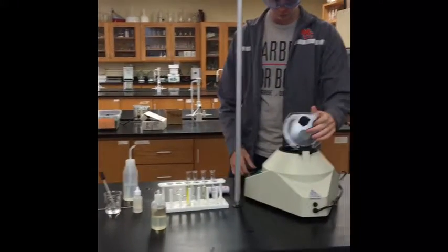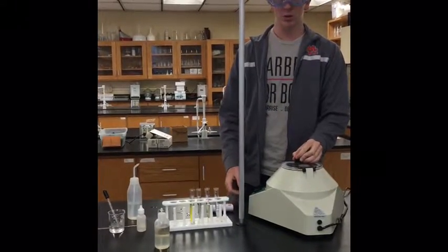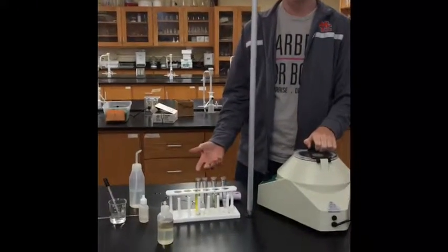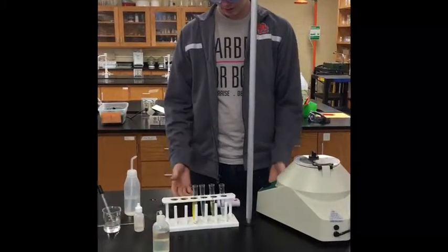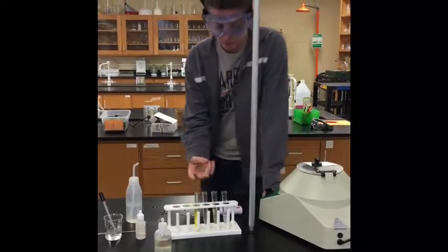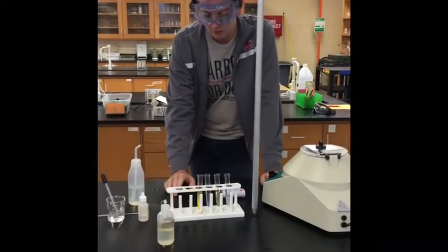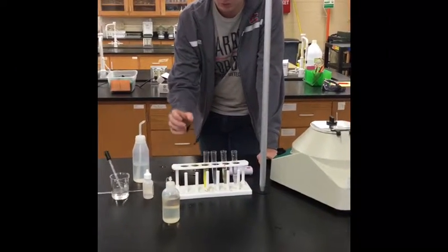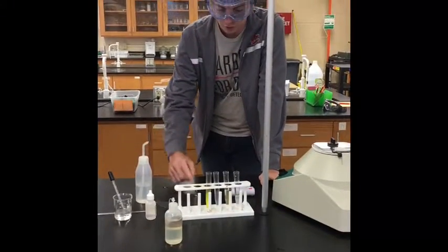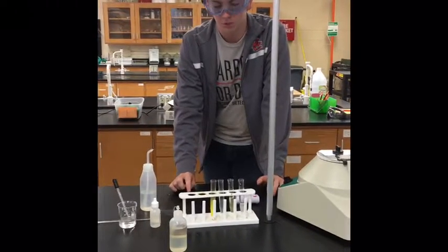This is a centrifuge and we use this during the lab final to separate your precipitate from the solution it is mixed with. You have two different types of centrifuge test tubes. One is unlabeled — just a clear glass tube — and you use that to mix your solutions together. Take your first solution, put it in the tube, dilute it with a little bit of water, then add your other solution to cause the precipitate to form.